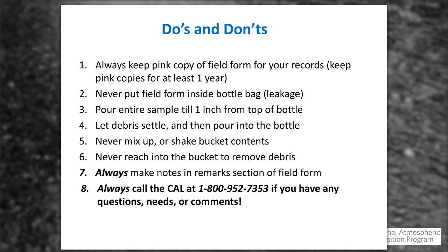Let debris settle, then pour into the bottle. If you can get around the bird droppings and the leaves and the dirt and stuff like that, go ahead. We don't want you to shake it or try to swirl it around to where it's on one side of the bucket and you pour from the other. If it just happens to go in there, that's something we want you to make note of. That kind of goes along with number five, never mix it up, shake it. Never reach into the bucket to remove any debris. Your hand should never even come close. That's why we supply gloves as one of the supplies on the field forms if you're running low on those.